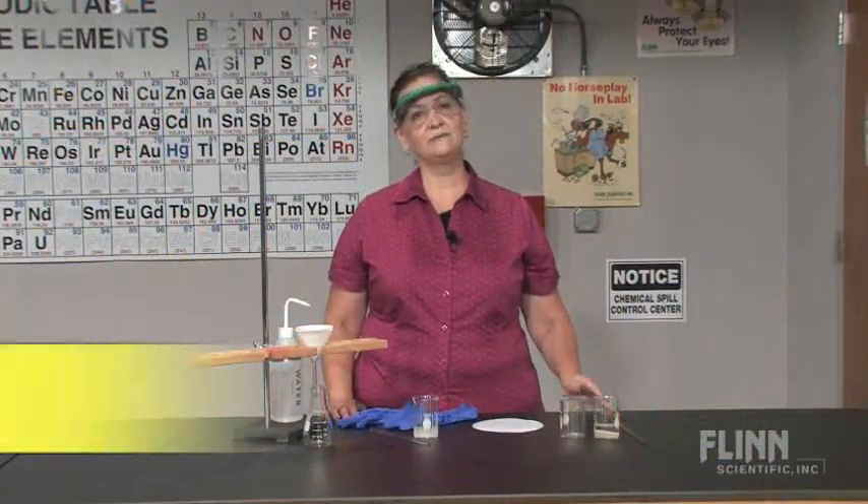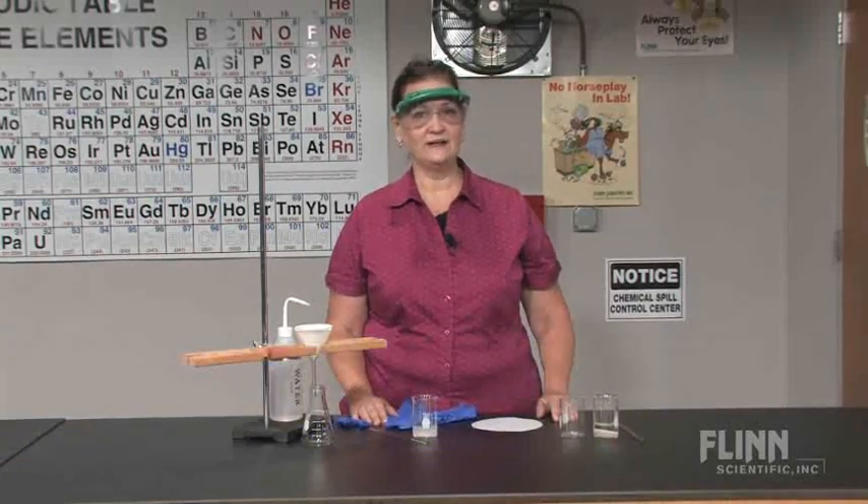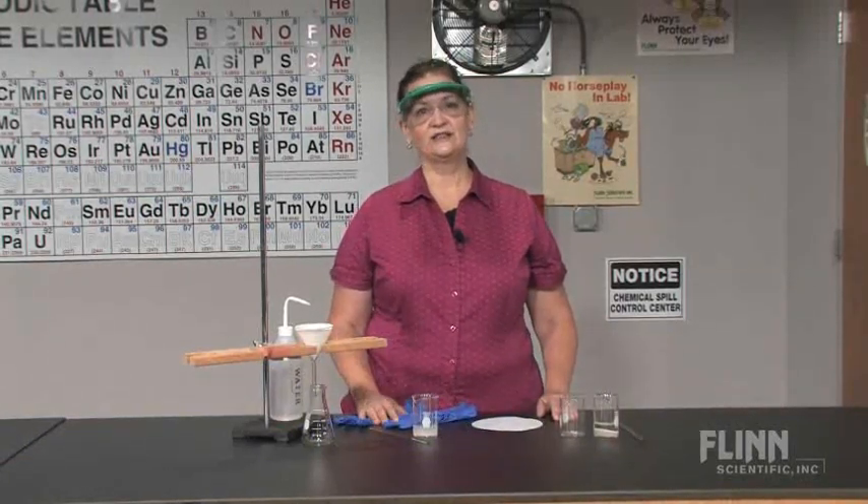Sometimes a procedure calls for separating a solid from an aqueous mixture. When you want to collect and study the solid, especially quantitatively, then filtering is an appropriate method.